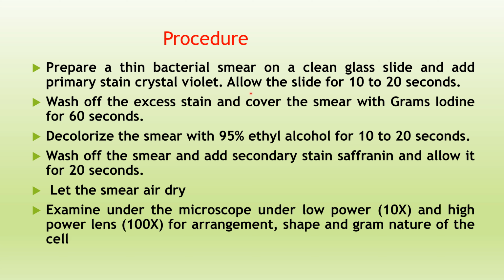So now after the addition of crystal violet, we need to keep the slide for 10 to 20 seconds because the bacteria need to uptake the stain. Now we have to give some time. Then wash off the excess stain and cover the smear with Gram's iodine for 60 seconds.